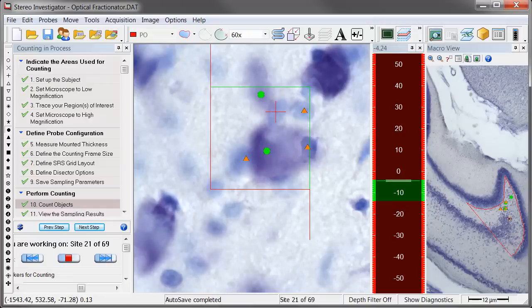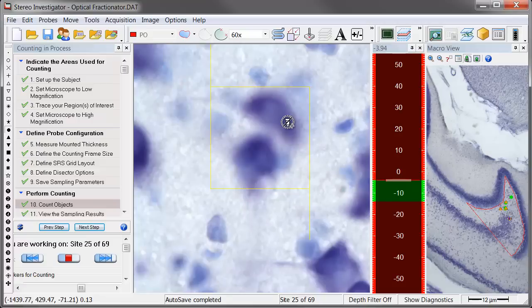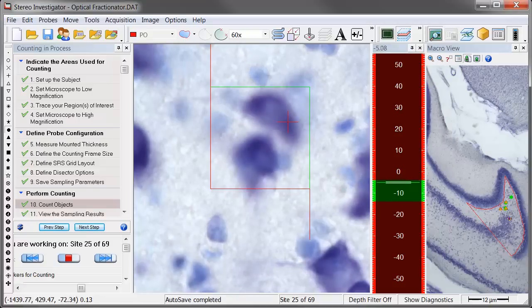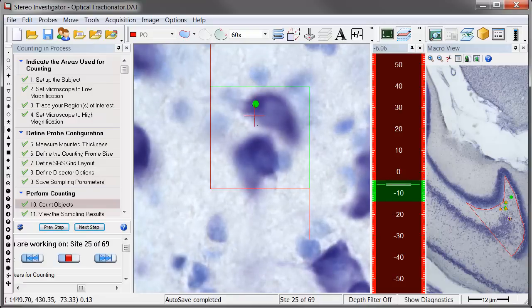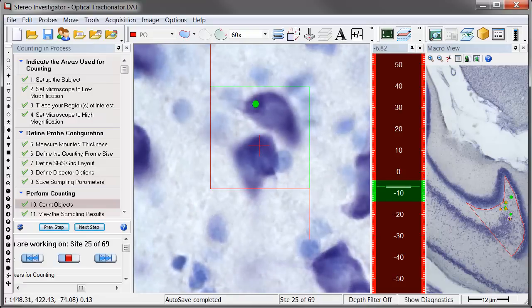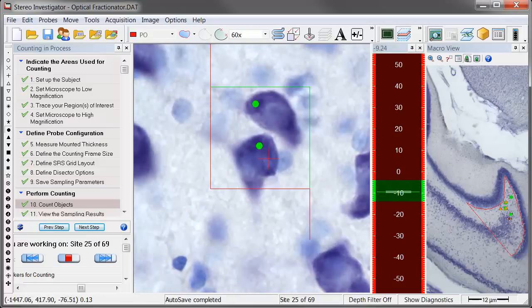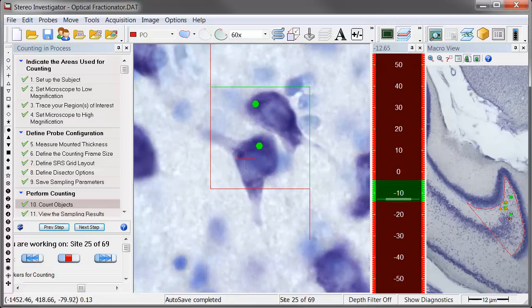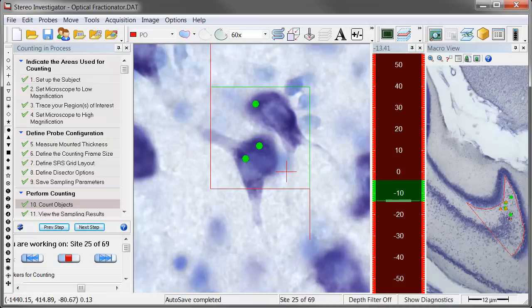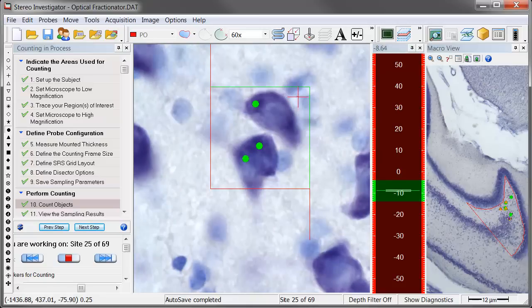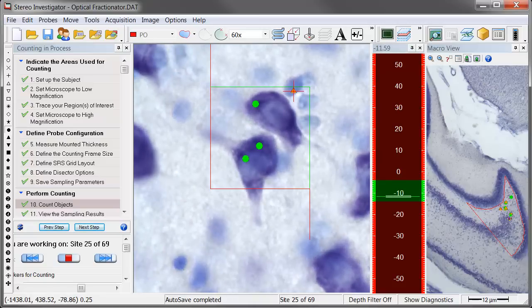The innovative StereoInvestigator workflow makes performing stereology easier than working with any other system and prevents users from compromising their experimental results. This workflow was created with our users in mind to make it easier for them to perform stereology and to allow them to better train other users.